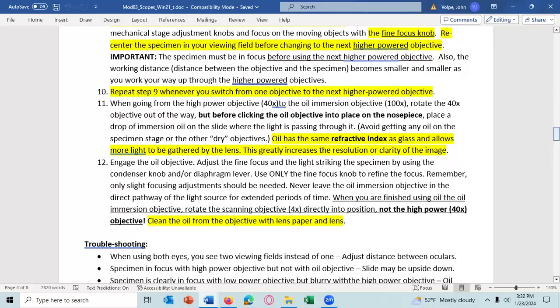It is true we have lens cleaning fluid and Q-tips, but generally when students have a problem, they usually call the instructor over, and then the instructor cleans the lens with the lens liquid cleaner, the cleaning solution, meaning we don't give it to students. And generally we don't have Q-tips for you to clean the lenses also. So generally only the instructor uses the Q-tips. So students generally will only use lens paper to clean the lens, which its purpose is obviously to remove oil from the lens, as well as to clean any junk that might be on the lens.